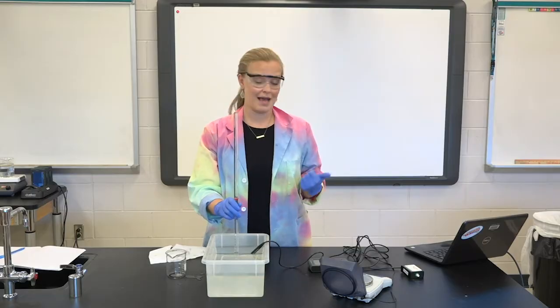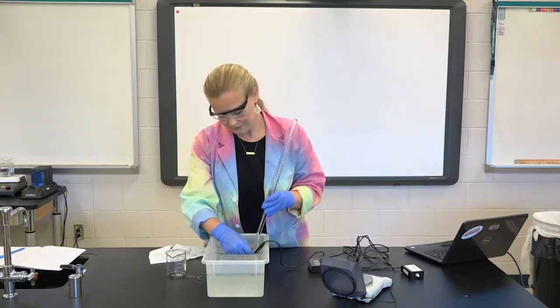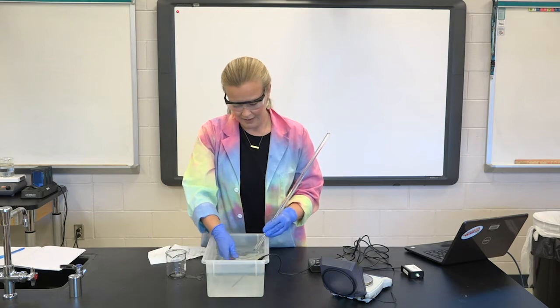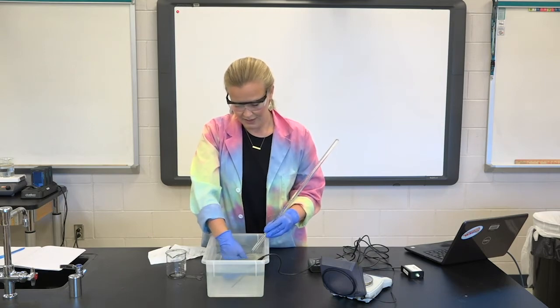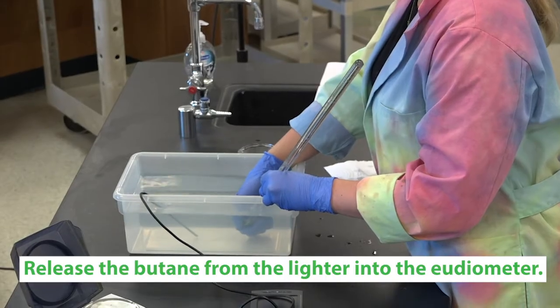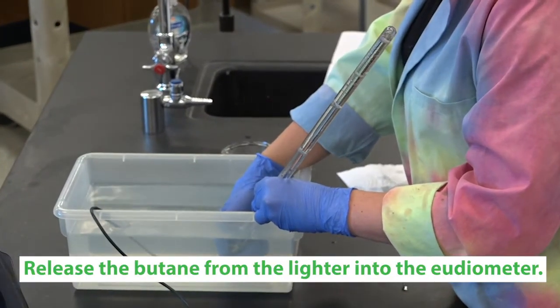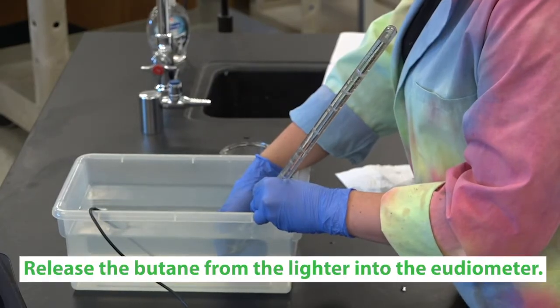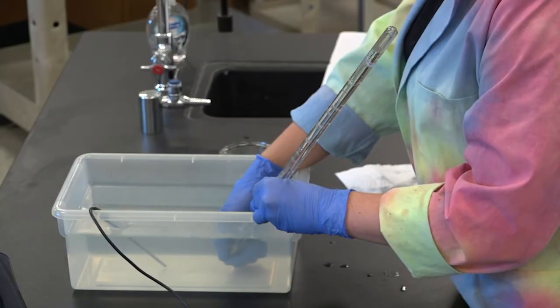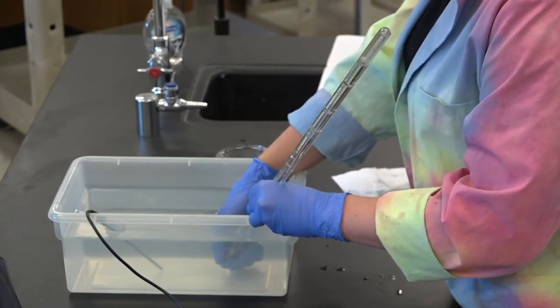Now we're ready to go — we've got our mass and everything else is set up. Take your lighter, line it up underneath your eudiometer tube, press the button, and start collecting. You're going to see some bubbles rising up in the eudiometer tube. It's just a matter of having some patience because we need to fill this tube up until it's almost at the 50 milliliter mark. It's going to take a while.